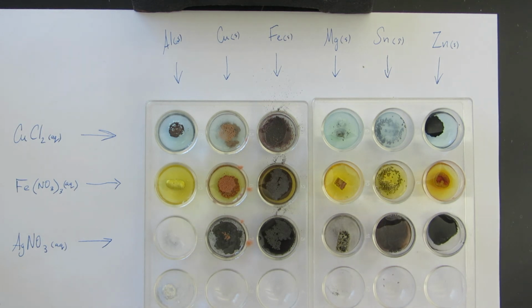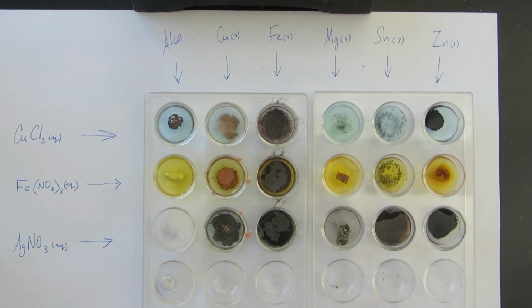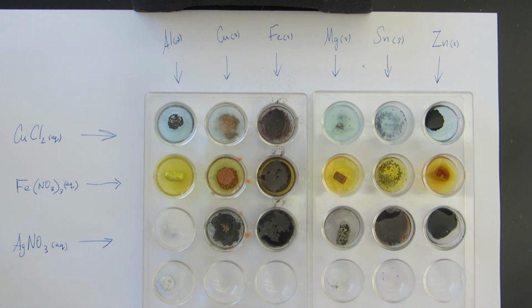So I'm not really seeing any reaction take place with the silver and aluminum. So we expect it to. We expect the aluminum to be more reactive than silver, so we expect something, but I'm not really seeing it. Maybe it takes a long time. Maybe it has something to do with the coating on the aluminum. All right, the copper is definitely more reactive than silver. We could see that. Copper looks like it's less reactive than iron because we don't see anything happening there.